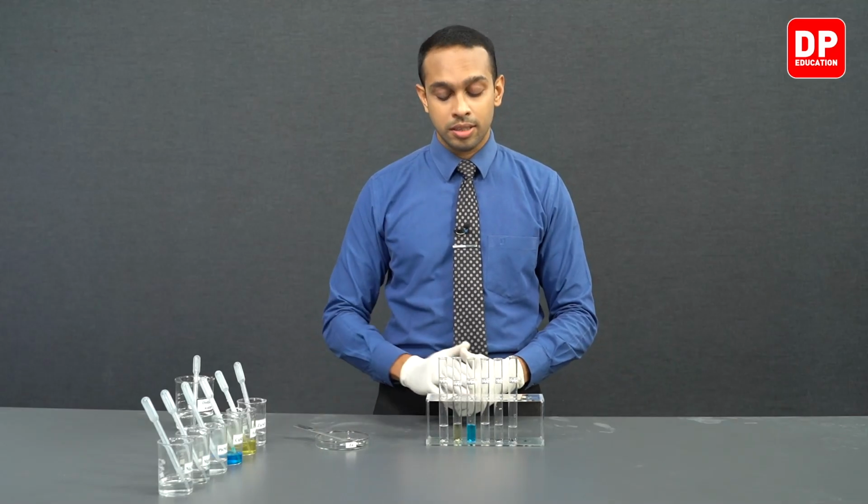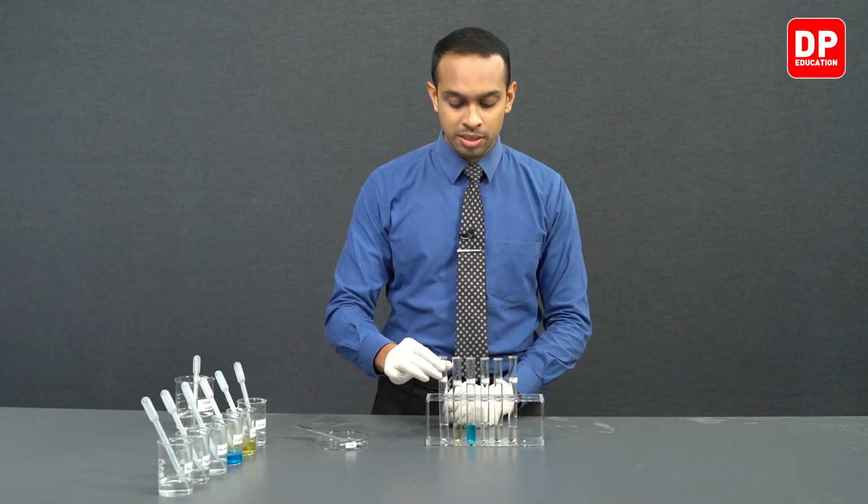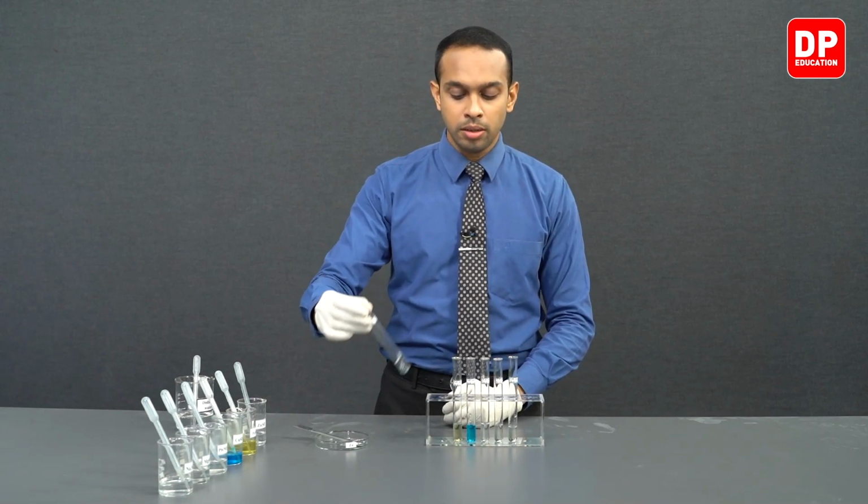Now students, we have added zinc metal to each of these solutions. We will mix each of these solutions really well.